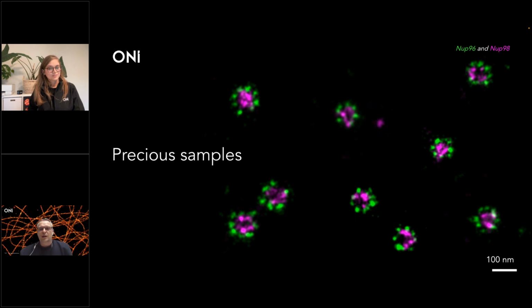In this case, I would recommend Petri dishes with a glass cover slip on the bottom, but then you will need quite a lot of volume to label. However, you can also use 6 or 8 well dishes which have a glass bottom surface, but the minimum volume they need for incubation is around 100 microliters. So that's what I would suggest.